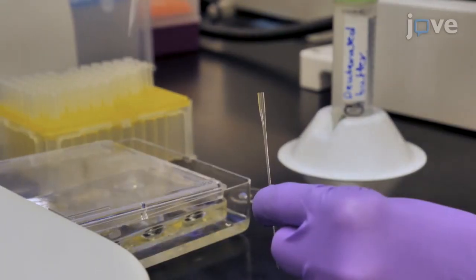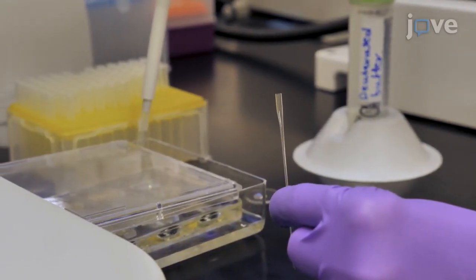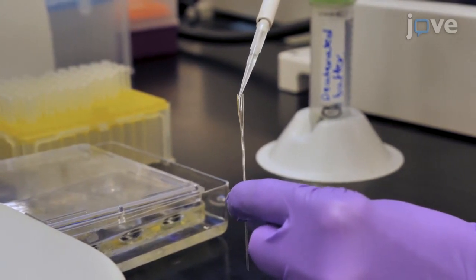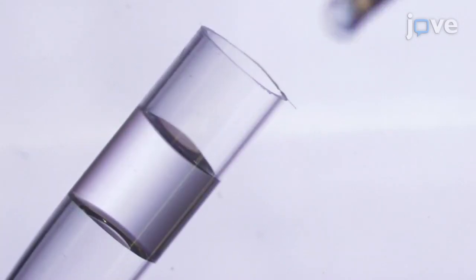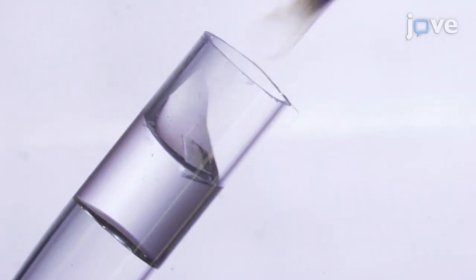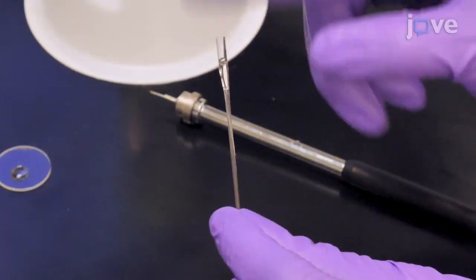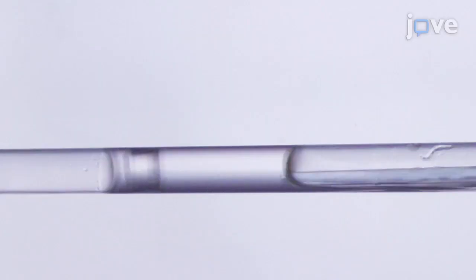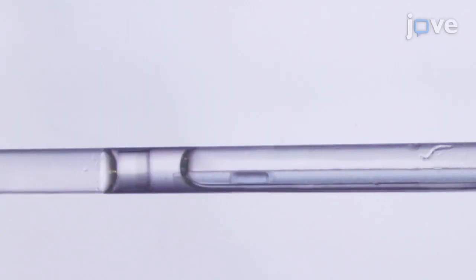For crystal mounting, take a 2 mm diameter, 50 mm length quartz capillary, aspirate reservoir buffer with a pipette, and fill one end of the capillary with reservoir buffer. Use a mounting loop to gently place the crystal into the reservoir buffer within the quartz capillary. Tap the tube to move the reservoir buffer and crystal down the capillary, and use a long, thin pipette to aspirate the solution from around the crystal.